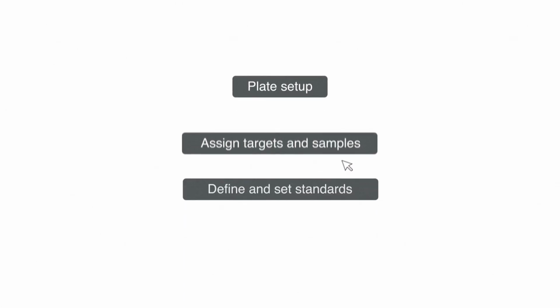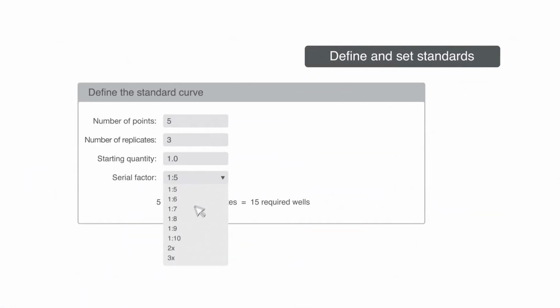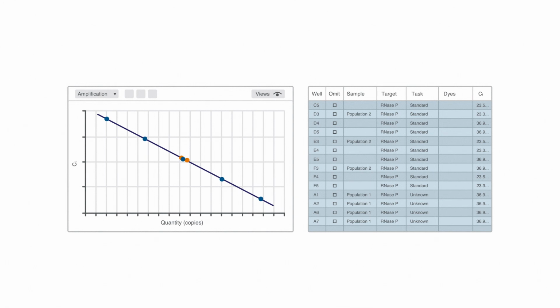Now that we have our standards, let's set up a dilution curve in our plate. We recommend running a triplicate with 10-fold dilutions and at least 5 data points. When set up correctly, all Applied Biosystems real-time PCR instrument software will generate a standard curve for you from these points. The equation of the linear regression line through these points is then automatically used to calculate the quantities of any unknowns on the plate in the same units.